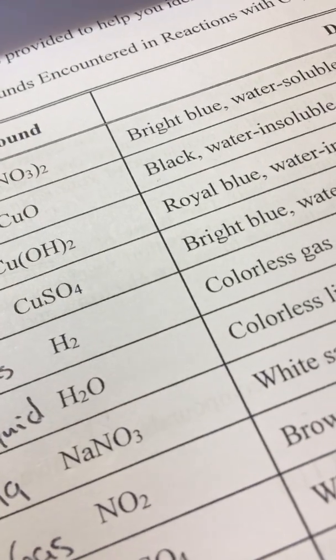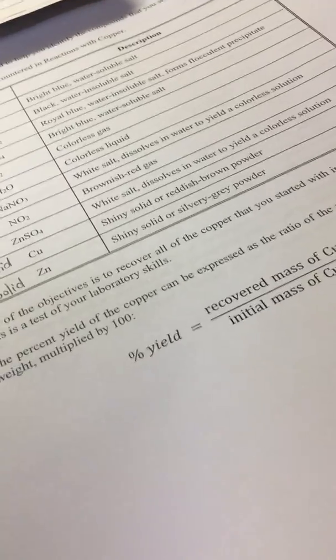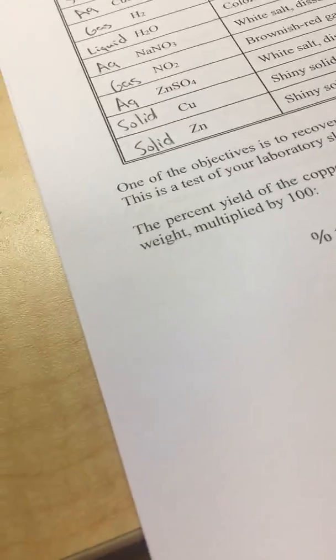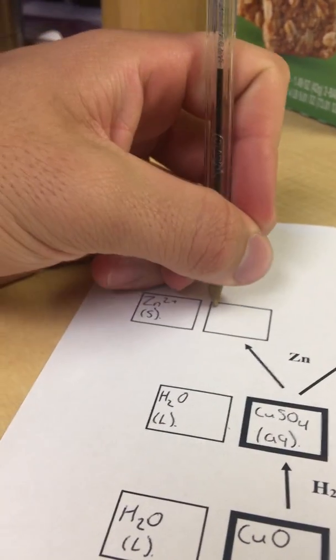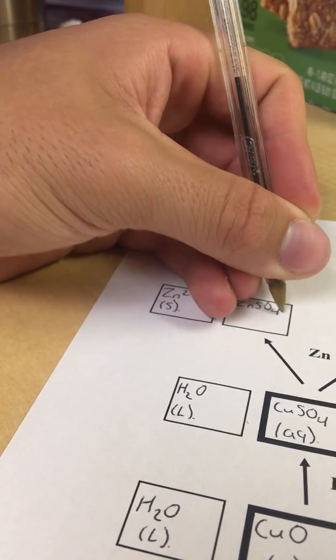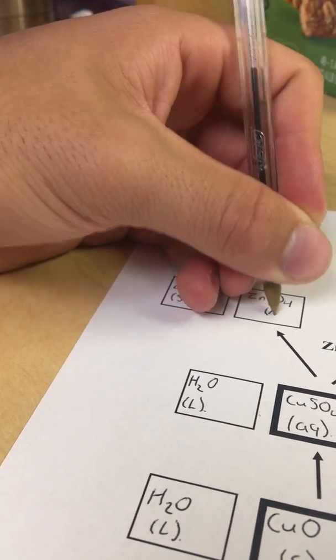Okay, then the other one would be ZnSO4, which is right here. White salt dissolves in water to yield a colorless solution, which is true because once the zinc was added, the solution turned back into clear. So right here would be ZnSO4, and that is aqueous. Okay.